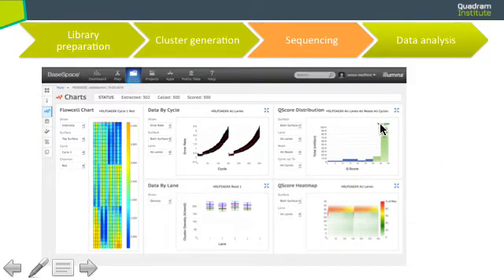And it says here around 80% of your reads that have been sequenced are of good quality. So this can determine if the sequences that are generated are actually of good quality. And this will be your first quality control measure. So here you can see that there are this many clusters that have been formed, and these clusters are being sequenced. But how many clusters are actually good ones? How many clusters can you actually get some data out of? And this graph can give you that information.